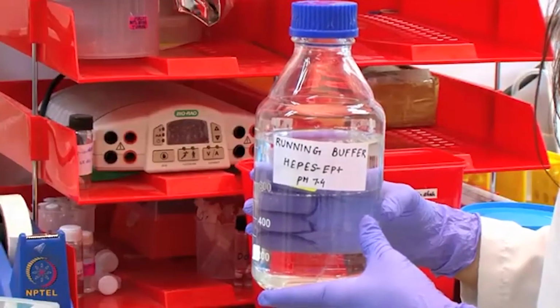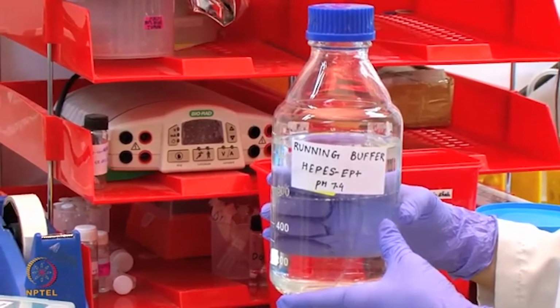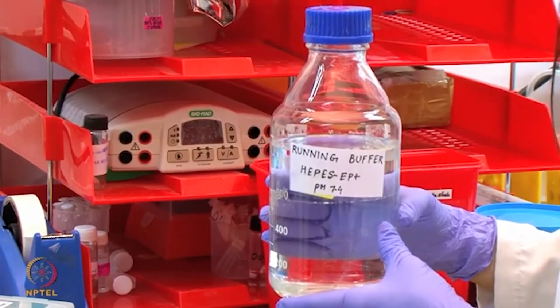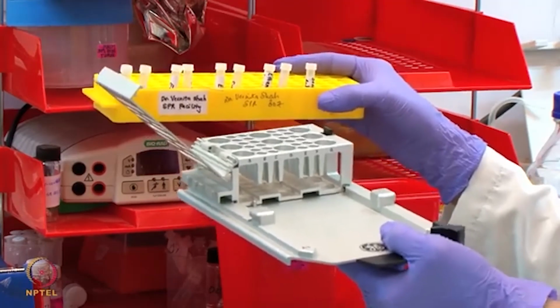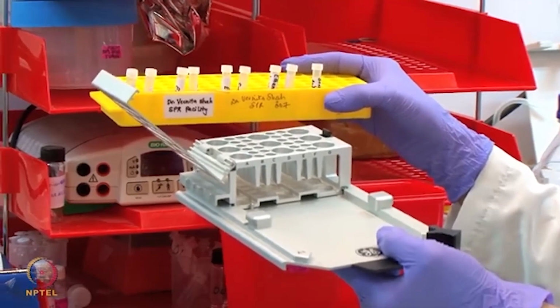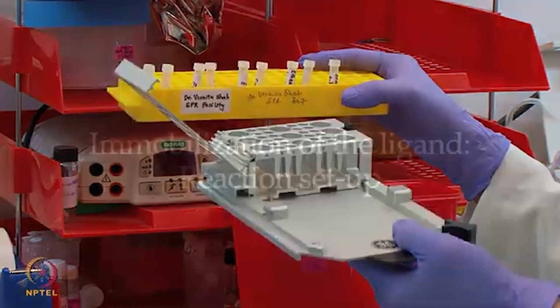We will be using HBS-EP plus as the running buffer, which will be connected to the system prior to the initialization of the immobilization run. We will now proceed to insert these tubes into the appropriate rack and then into the system for immobilization of anti-beta-2 microglobulin on the sensor chip surface.